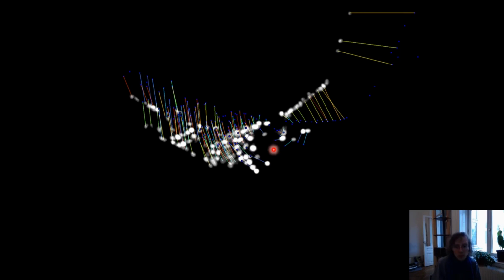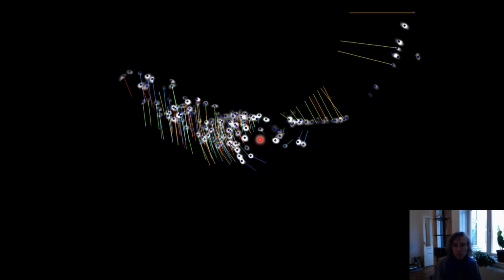In principle, these tracks will accumulate errors, as you can see here, and so they're only stable for a short period of time, which could be some seconds or could be a couple minutes for some relatively easy or more isolated and trackable neurons. So we can see that in the next frame, many of the neurons have moved to their partners and are successfully tracked. And then we can create our beautiful tracklets from this.